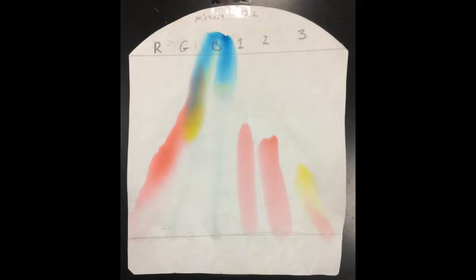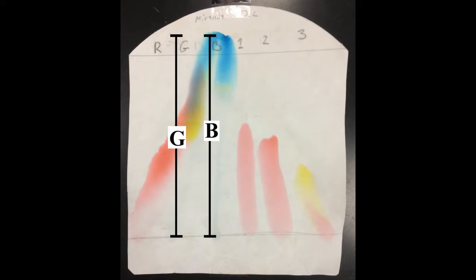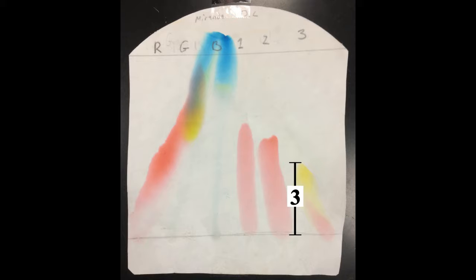Some components of the green dye may have also been separated, but it's hard to tell since it mixed with the red. This happened because the chromatography paper was bent when it was placed inside the beaker with the water. Through the chromatography lab, we have made a conclusion through calculating the RF value that the green and the blue were the most polar and the Kool-Aid 3 were the most non-polar.